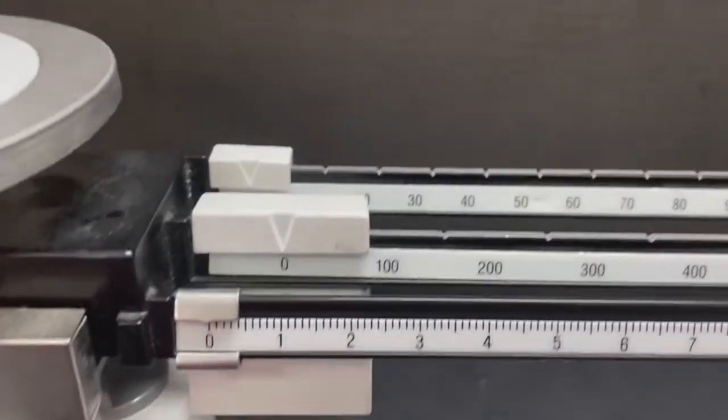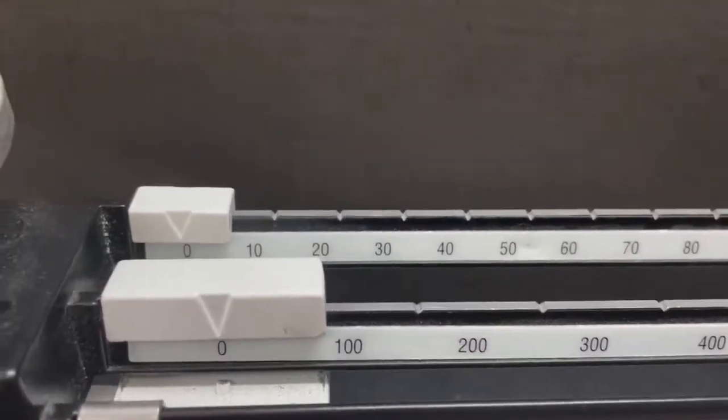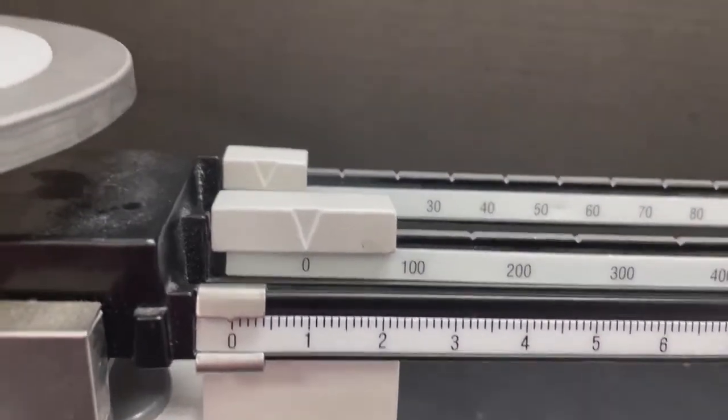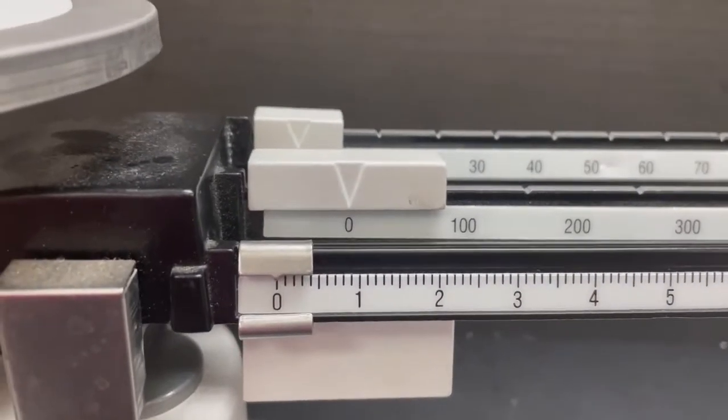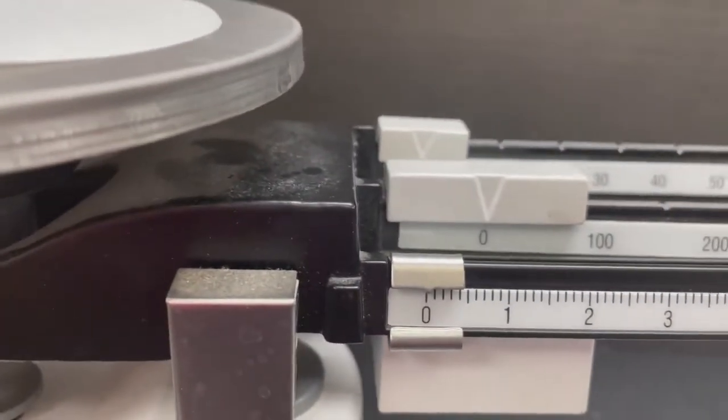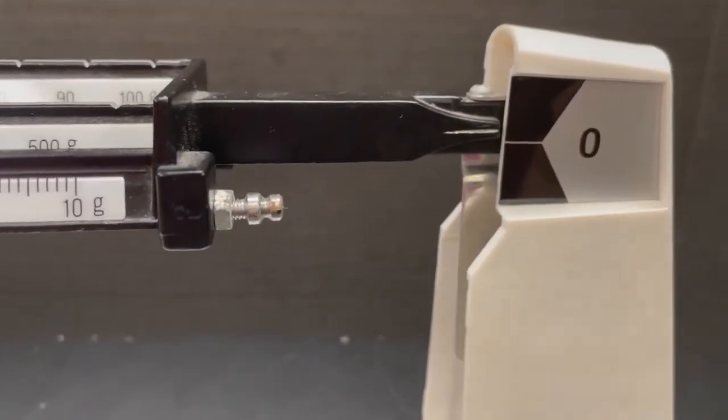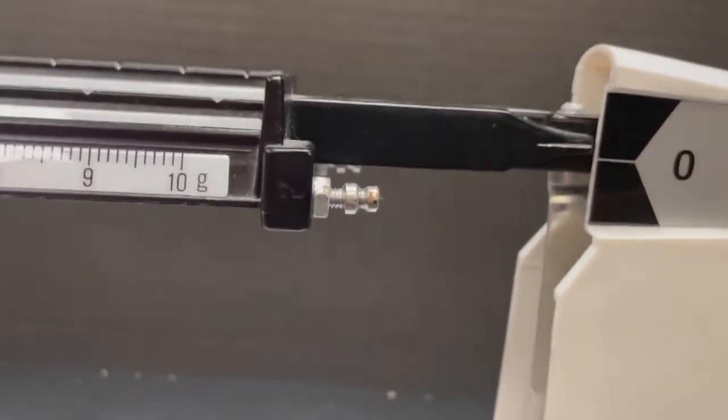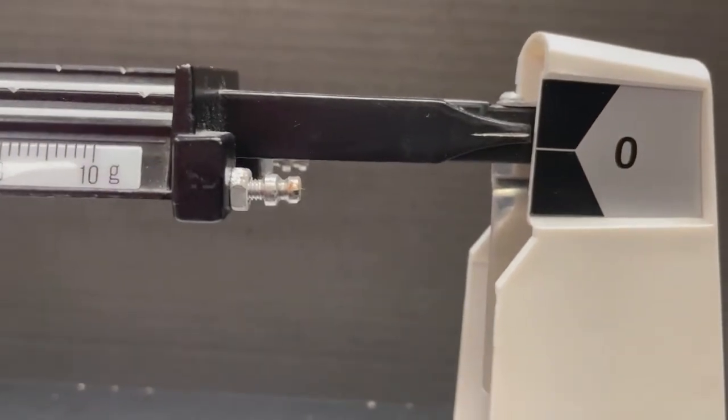Before we get started, we want to make sure that all of the weights on each of the beams is at the zero position. You want that to be where the pointer is pointing at the zero. Then, you want to go over and make sure that the pointer is actually pointing at zero to make sure that that is all lined up.